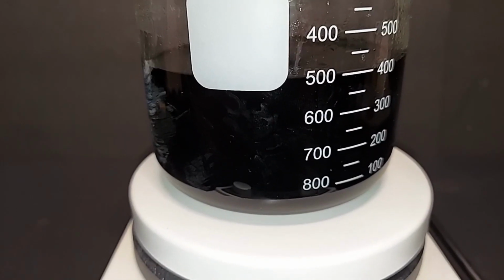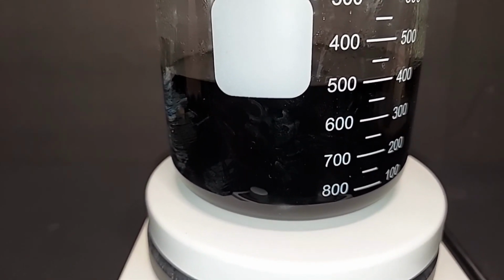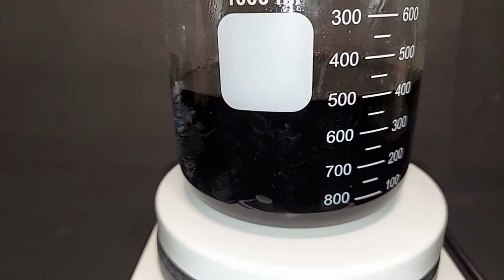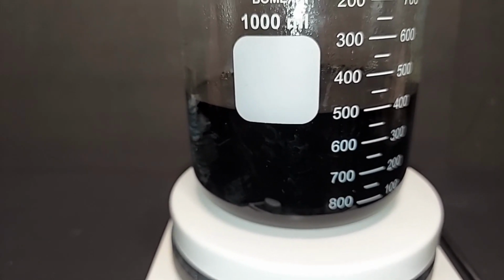Well, after 10 hours of heating, we are at 400 milliliters. And again, because of the gentle heat, it is taking some time to get this down. But looking at this now, I think I'm going to try to crystallize this at maybe 250, 275, maybe even 300 milliliters rather than the 200 and a little bit there that I mentioned earlier.